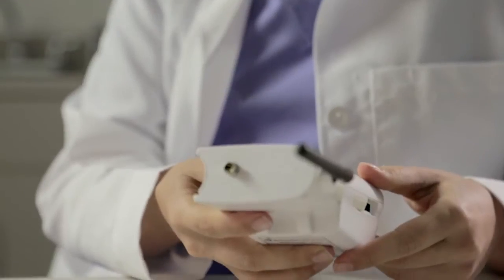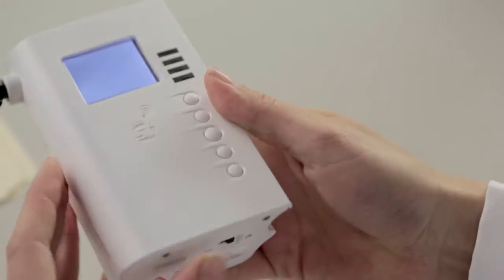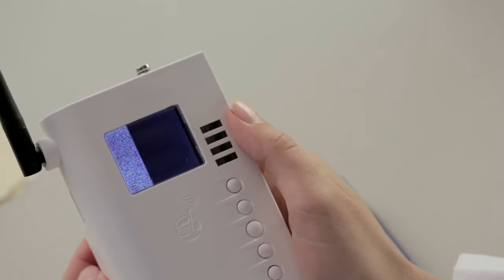The first step is preparing the sensor. Insert batteries and you're ready to turn it on. The sensor will automatically search and connect to your existing Wi-Fi router or access point.